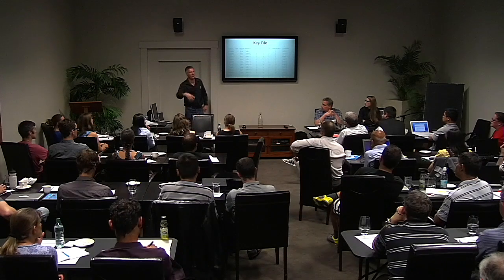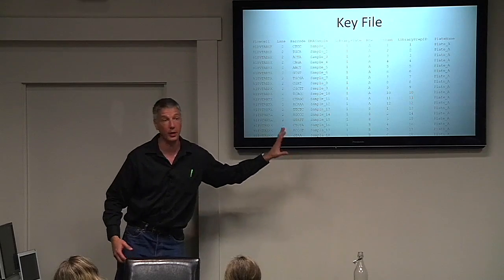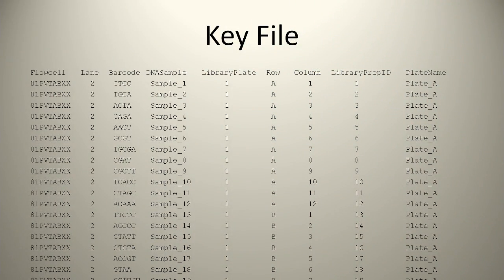I've run into this problem before. There are a lot of fields available in the database that the IGD is using, the HTS database, that I wasn't using, so I fudged it and collected that information in a field that I wasn't already using. But if you're building your own system, you can build that into the system, right? This is all around our talk about the key file and what we do to generate this stuff. It's really important that you do it and you store it right and it can be double checked. One definite usage of GBS is to find errors like that.